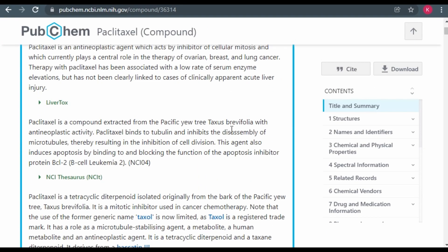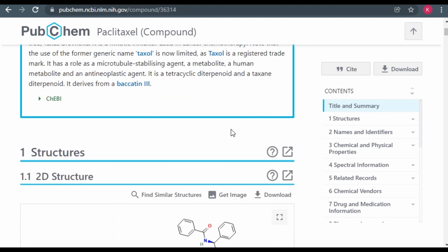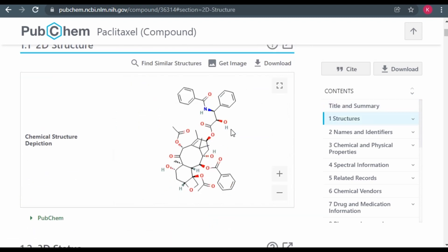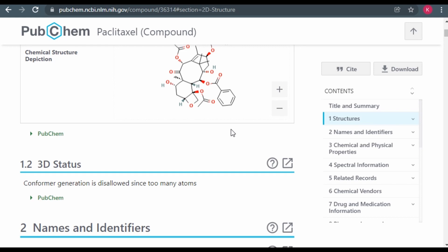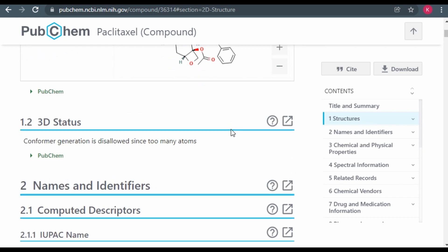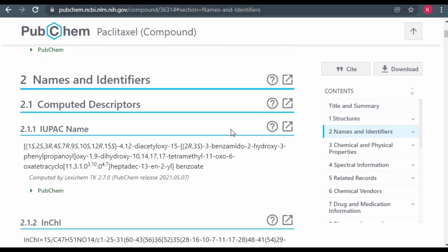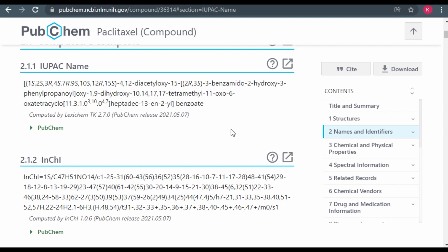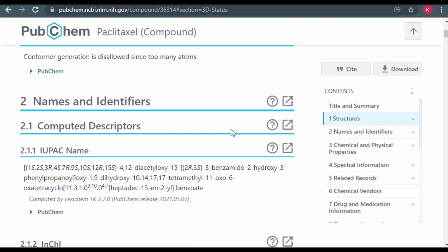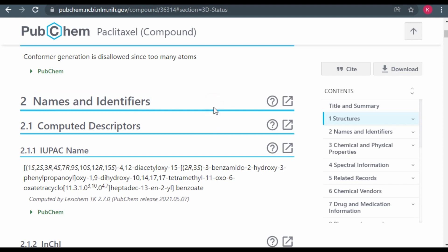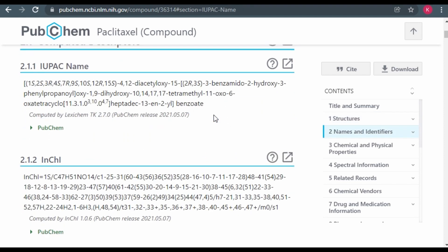This generates a page that outlines the various attributes of Taxol. For this case, we are more interested in the section for names and identifiers, which is section 2. So under names and identifiers, there are various other subsections, and we go to the subsection for SMILES.